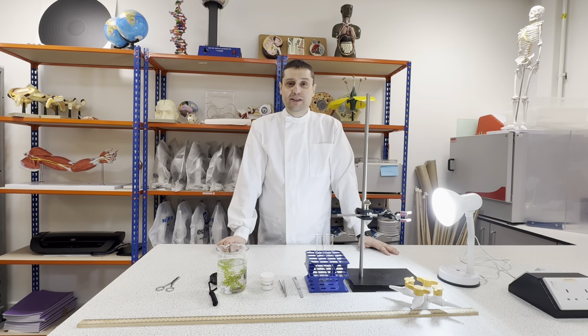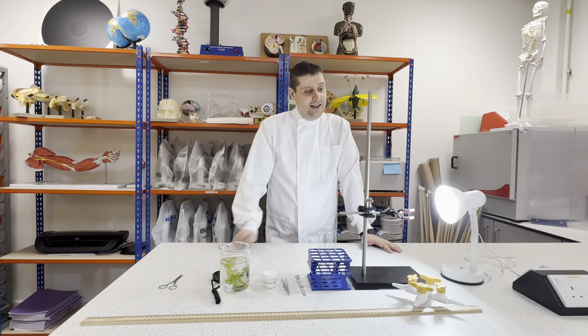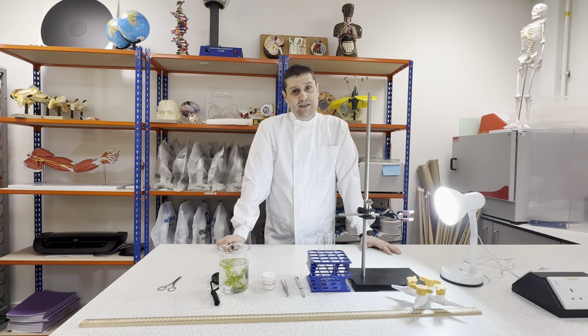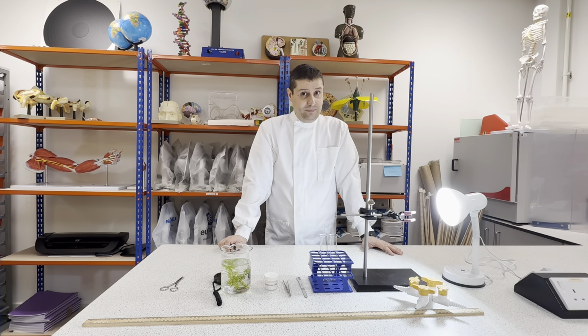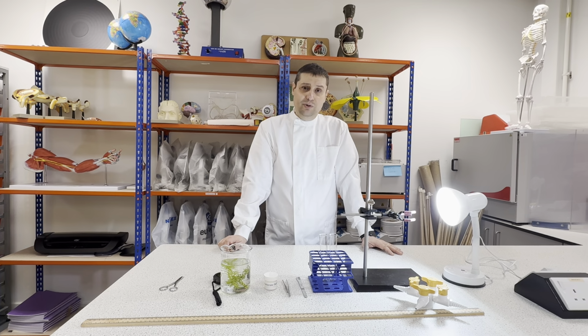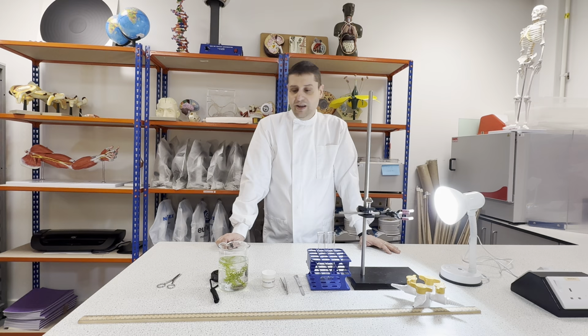Today I'm gonna be talking about photosynthesis, the rate of photosynthesis depending on light, okay? First, I will talk about the list of materials that is involved. Then I will show how to set up the practical, and then we'll see the bubbles being formed, okay?